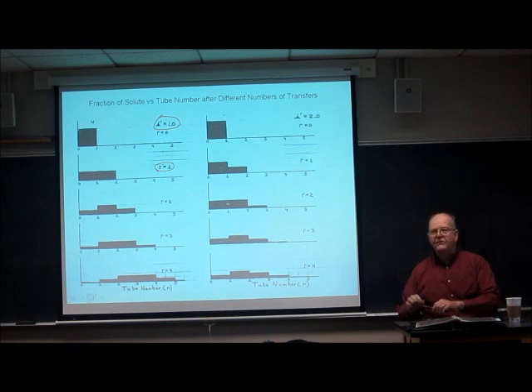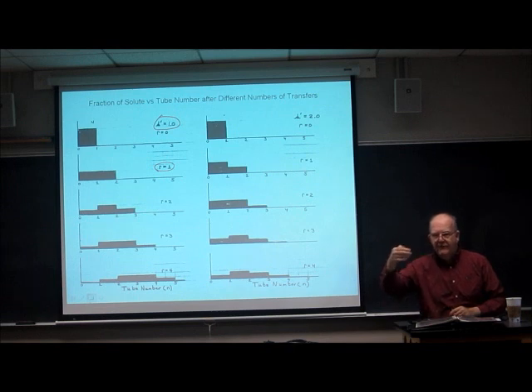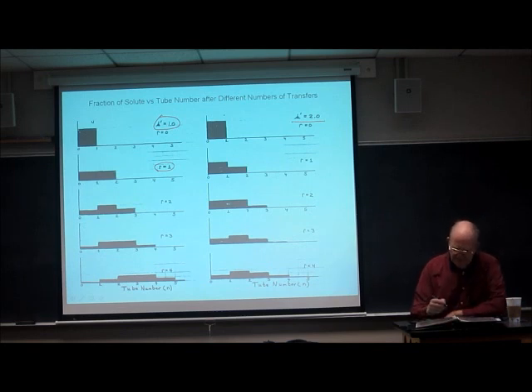Now, we can do the same calculation with P plus Q, where P is a third and Q is 2/3, and do the binomial expansion of that, or you can just work the problem in your head. These numbers are not that difficult to deal with. With K prime at 2, Q, the stuff that stays in the stationary phase, is 2/3, and 1/3 is in the mobile phase.